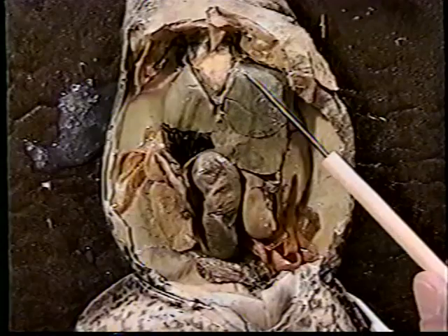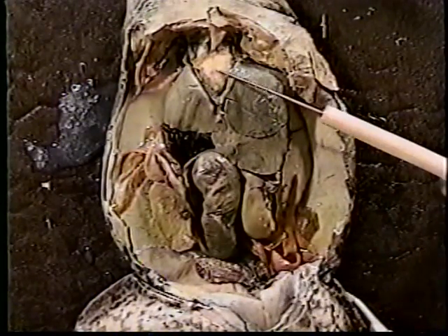When you're ready, the first system that we will take a look at is the digestive system. It obviously begins in the mouth with the teeth and the tongue, but the first area in which food is passed is the gullet. The gullet is buried beneath several organs which are in view right here. The gullet can be viewed as the link between the mouth and the rest of the digestive system.